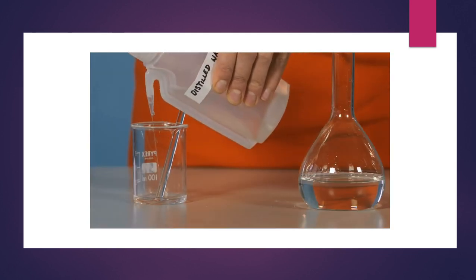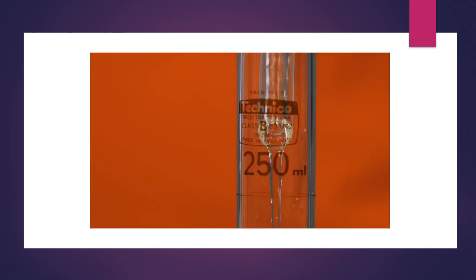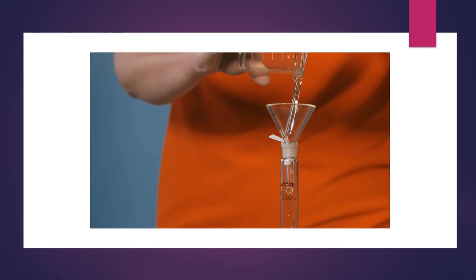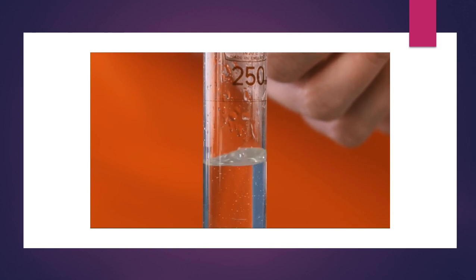Take care as well to only use a small amount of water so as to not go higher than the 250 centimeter cube mark on the volumetric flask. The same should also be done with the funnel. Add distilled water to the 250 centimeter cube mark. Take care to observe the meniscus at eye level rather than from above or below.